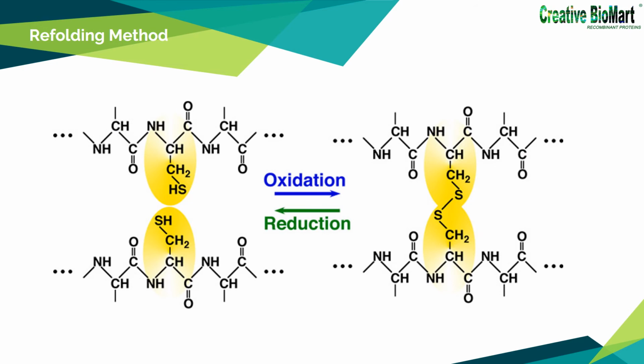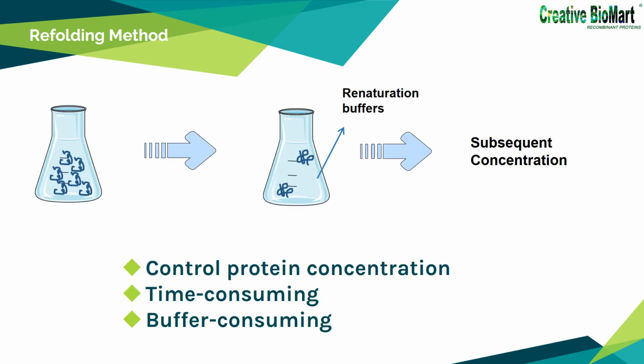However, there are certain rules for reference. If the native protein contains disulfide bridges, it is mandatory to first see that all these are fully reduced. It is then advisable to supply the refolding buffer with a suitable redox system allowing reshuffling of the disulfide bridges, which often facilitates the formation of structurally correct bridges by reoxidation. The more disulfide bridges the protein contains, the more difficult the process and the more important it is to find the optimal redox system. Here, I will introduce the two most used methods of IBs refolding.